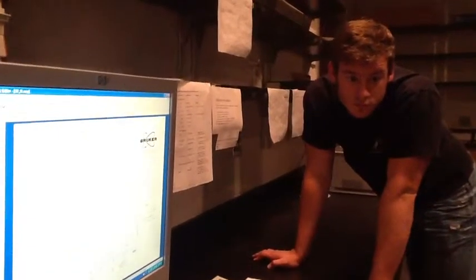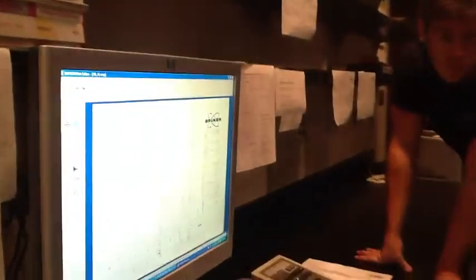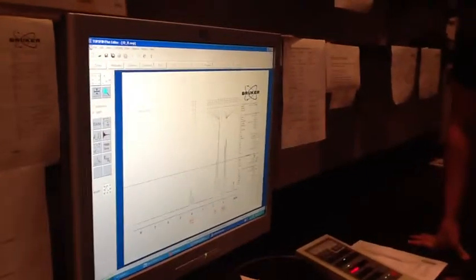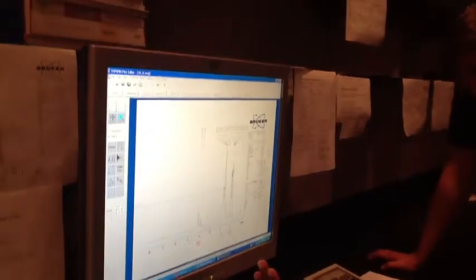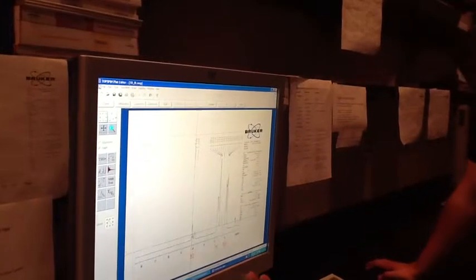Yes. Okay. So when you're looking over here, make sure that you're doing it per molecule. So it's giving you 3, but this 3 is coming from this molecule, so you have to divide that by 1. What I'm trying to say is, for your GCs and the NMR that I showed you in the lecture last time, remember how you have to divide the integration by itself to give you 1, because it's 2 different molecules, right? One of them is automatically scaled.